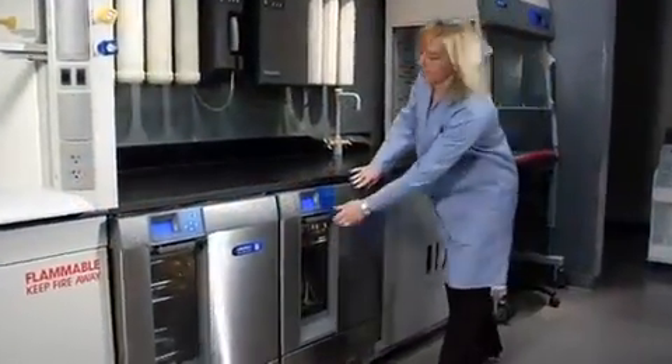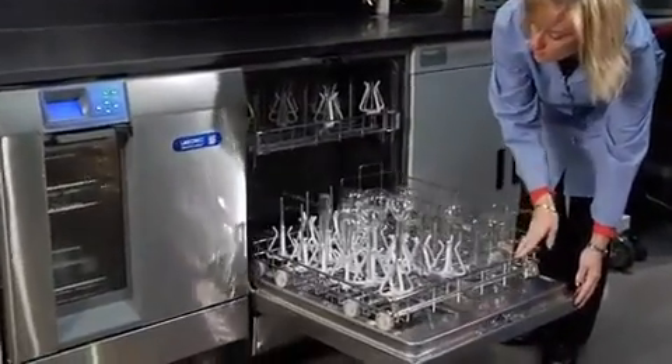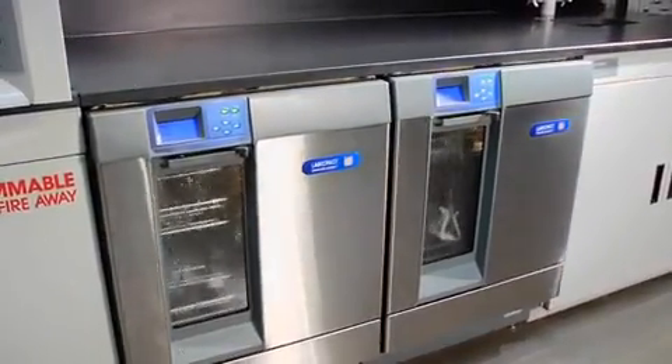LabConco glassware washers provide a safe, economical, and time-saving alternative to hand washing. By doing just two loads a day, you'll see the payback period in just two years.